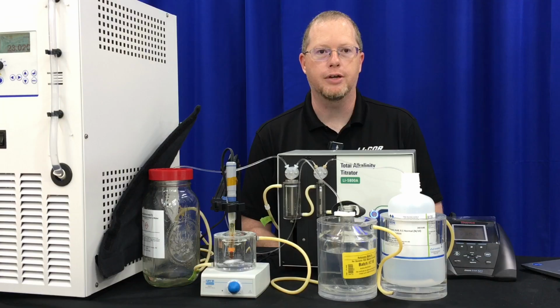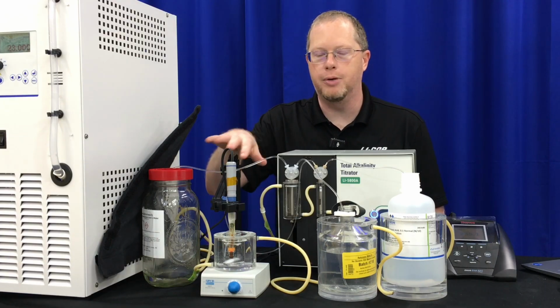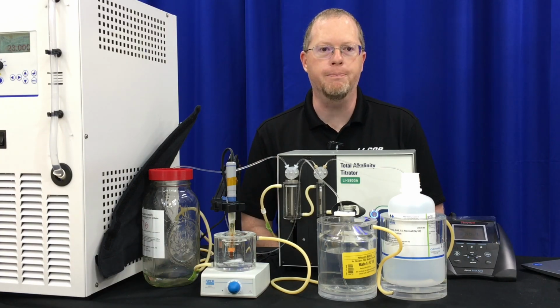We do have a tech tip online of how to make smaller measurements, especially for pore water, where you're looking at 1 to 2 mils of water. It will require a different probe and a different titration vessel. You can go online and find that tech tip online.